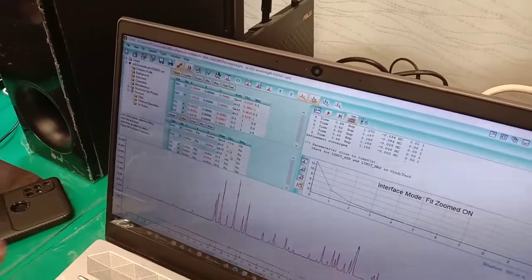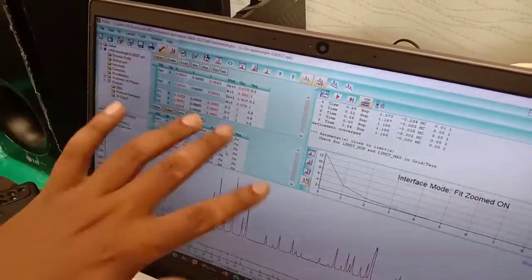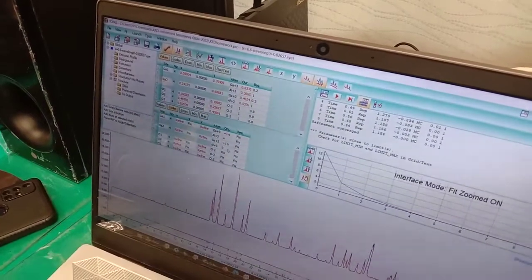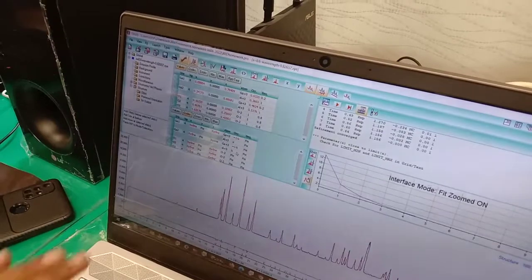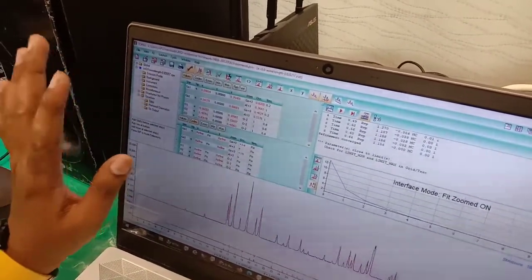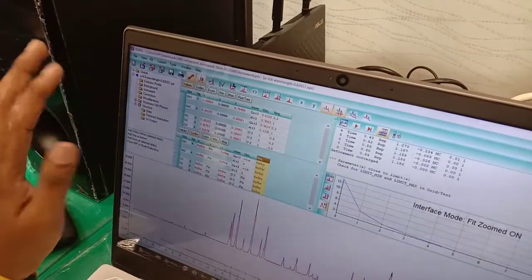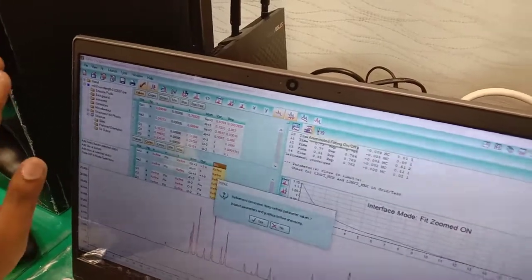Because I don't know what the composition is, I'm just teaching you, so I just say A and 1 minus A, but you have to check the constraint sometimes. Okay, so whenever you refine OCC, you always have to refine BEQ. So just open BEQ for everything and you just refine it.